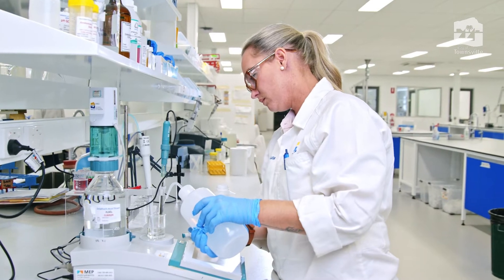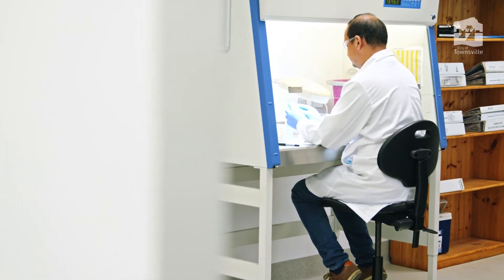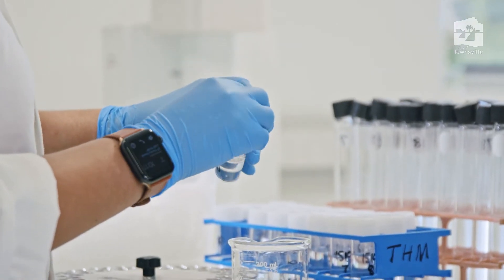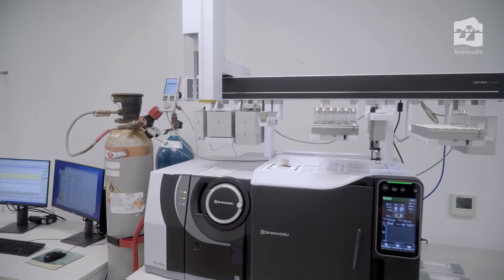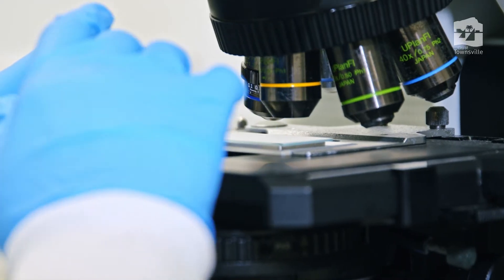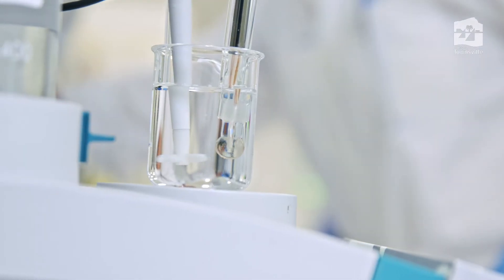We are proud to be able to offer fast, accurate and local analysis at competitive prices. Lab services offer pool testing services as well as a complete suite of biological and chemical testing and monitoring for large-scale infrastructure projects, agriculture, construction and many other industries.